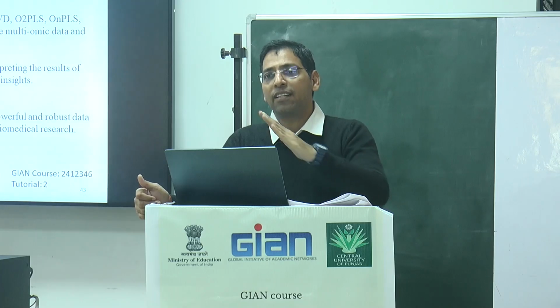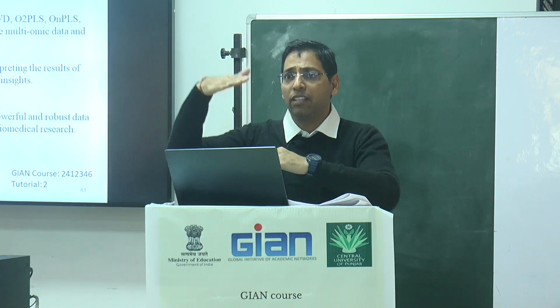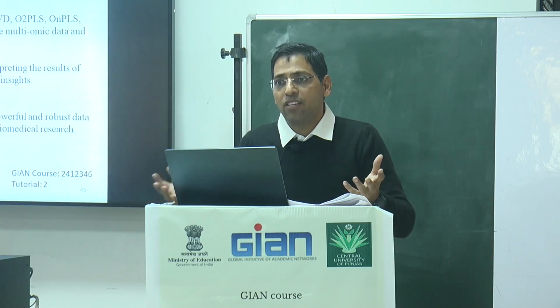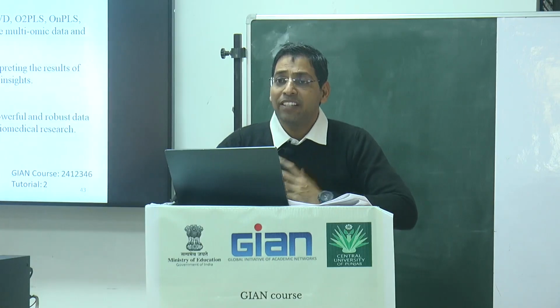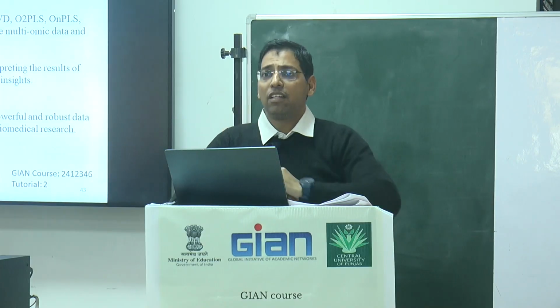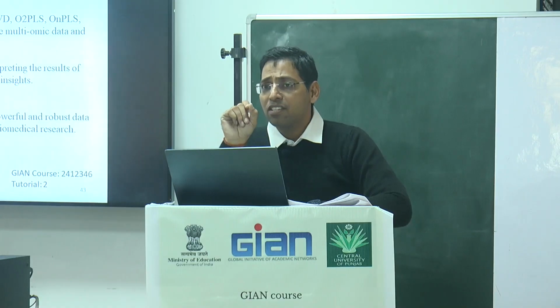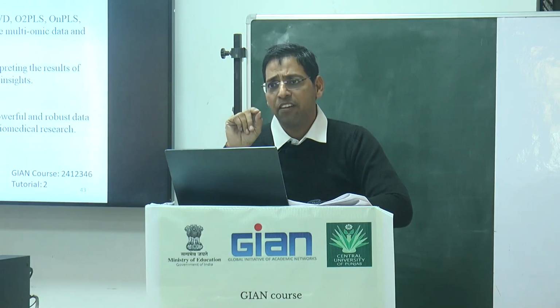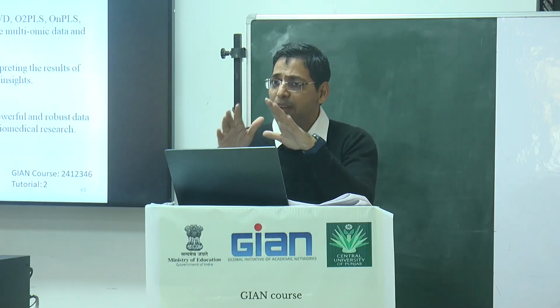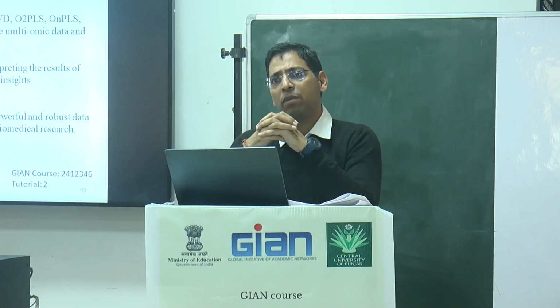Suppose you are increasing the concentration. You think that after some time you also get the peaks in the same proportion. No, because of saturation and some different type of interaction coming up, it will give the response only up to a specific concentration. So first of all you fix the concentration of the internal control that gives the best peak. Then the same quantification can be applied to your sample. You can quantify your sample also by doing this.